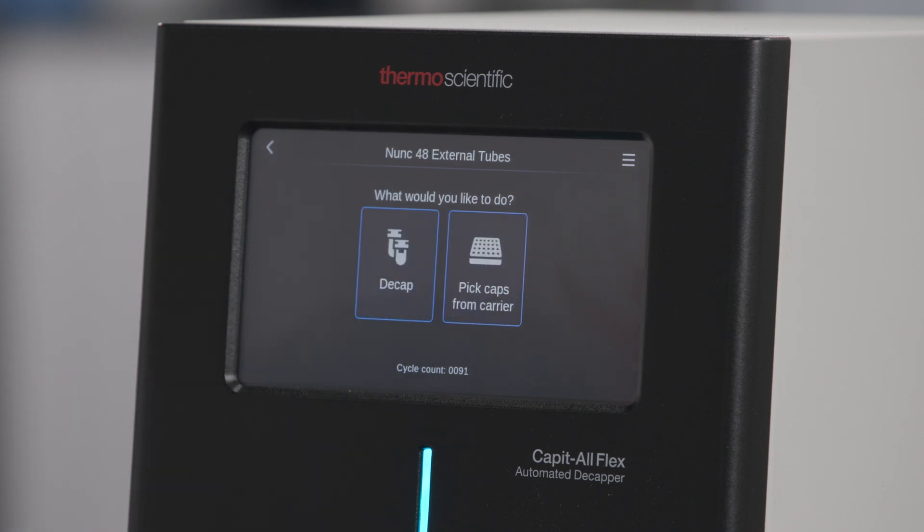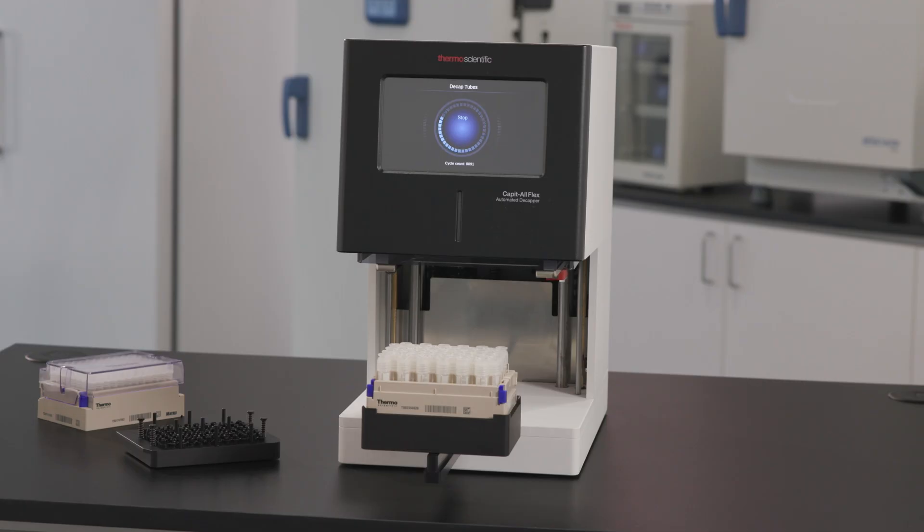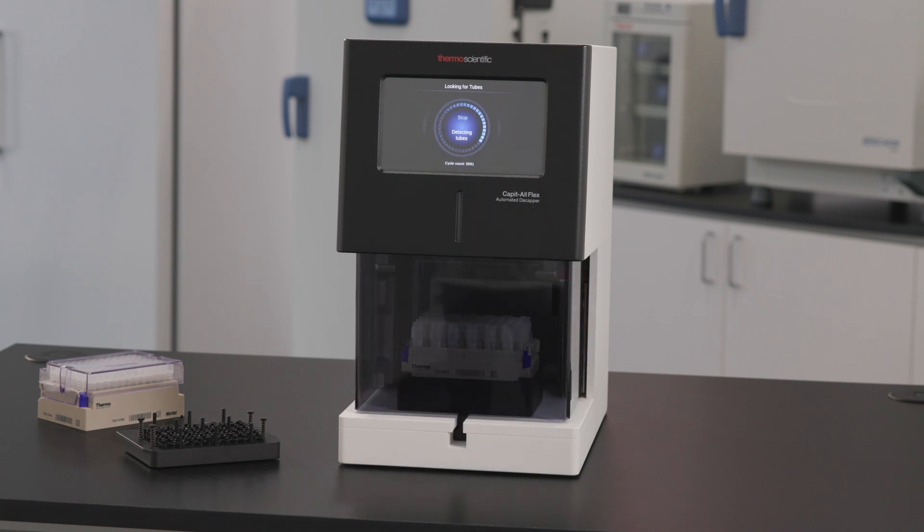Next, you'll need to select your operation. Select Decap to decap tubes, or Pick Caps from a carrier to pick up caps from a tray. The instrument will then detect which tube is being used so it can apply the appropriate parameters and begin the decapping process.